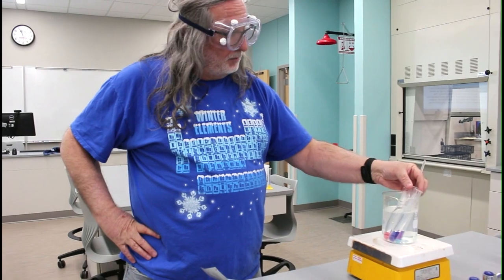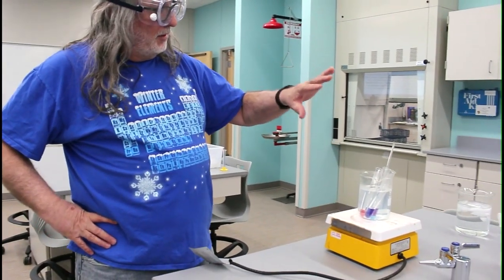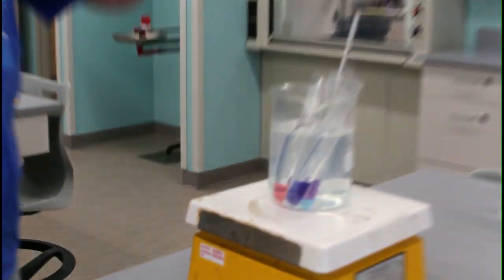And then the next part, we've got them at the high temperature. We've added some heat, and it's forcing the equilibrium toward the other side. Why? And then we're going to take them, put them in our ice water bath here, and cool them down. And what do you suppose is going to happen as they cool?